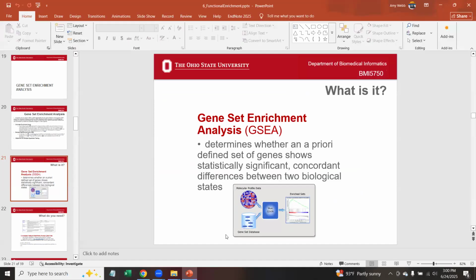Chat. Confused with the term not DEG with respect to all the genes that are GO term but not to all the genes.